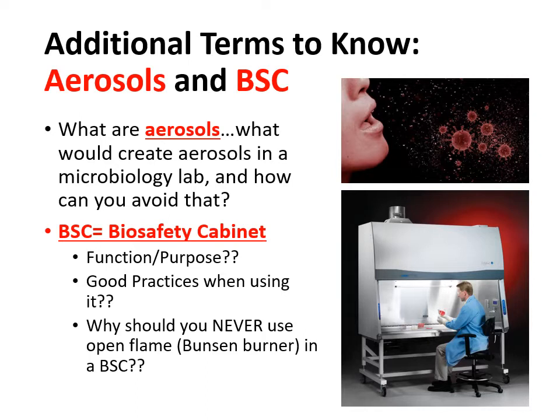Now, I want to point out that when you're doing microbiology experiments, a lot of times people will work with metal inoculation loops to grab the bacteria and to put it on plates or to perform their experiment.